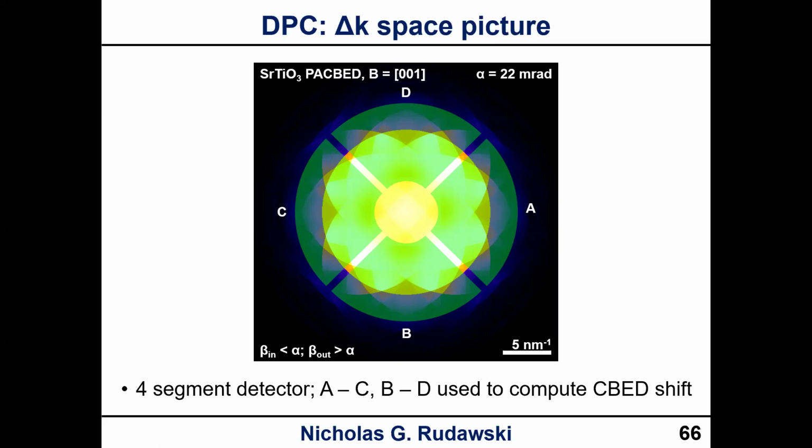It's actually very interesting. I've seen this happen where the beam scans over a magnetic domain and you can literally see the direct disk shift by quite a bit because of the domain structure there. It's really cool to see that happen. And again, that's because we've turned off that internal magnetic field from the lens that we can do that. Okay, so hopefully that clarifies that.